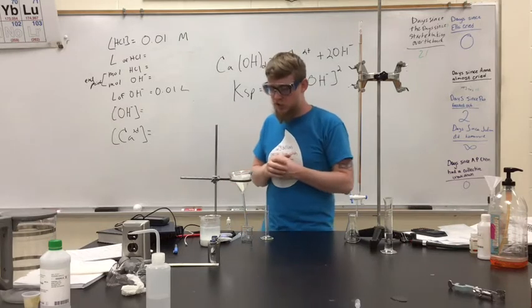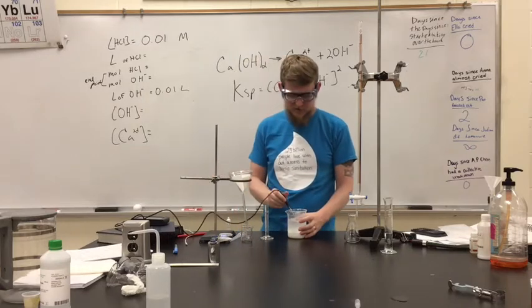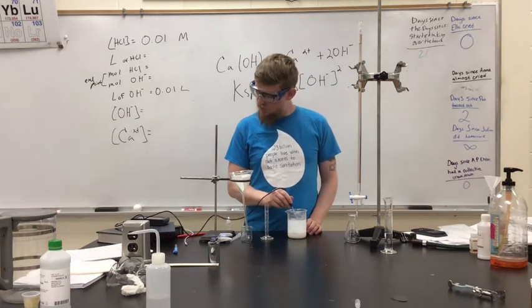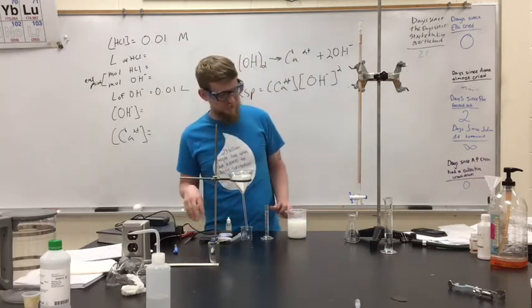All right, so before we begin, let's just take a look here at the temperature of our solution. The temperature of this solution right here is 21.7. You should write that down. It's going to be important.